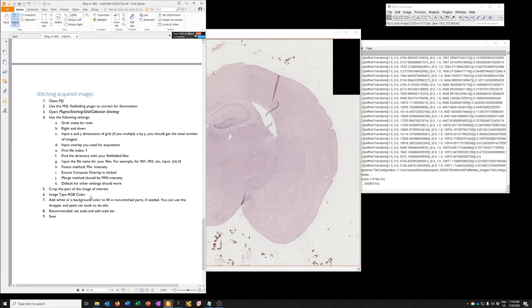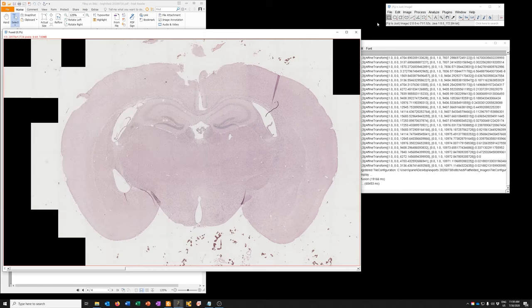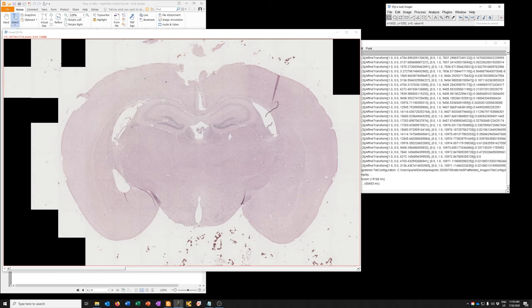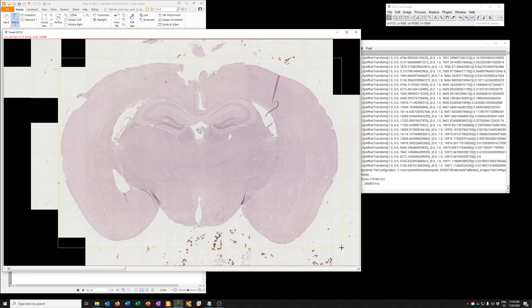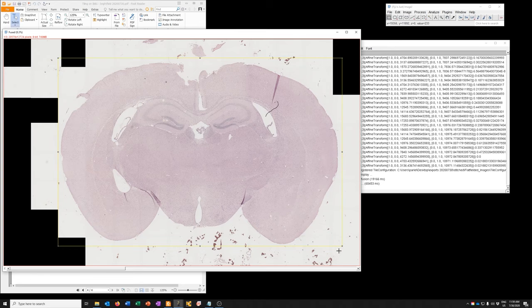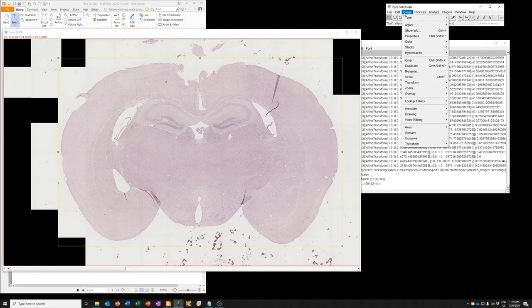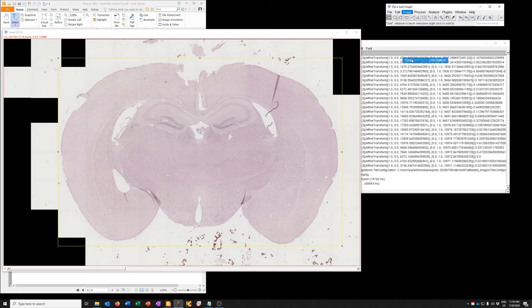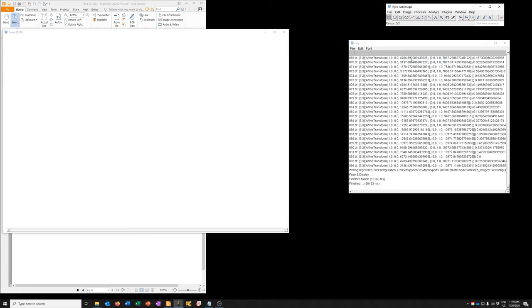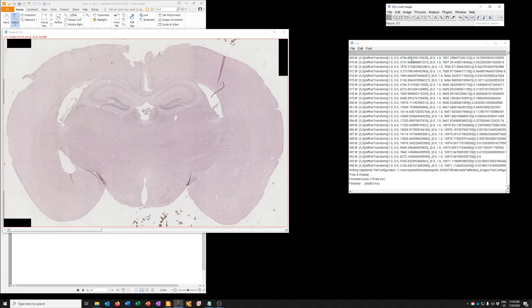Crop the part of the image of interest. OK. Let's do that. We select this rectangle tool. I want to make sure I don't miss anything. I'm not missing anything there. This looks good. I'm going to select there and then go to Image. Crop. OK. There we go. Let's see the next step.